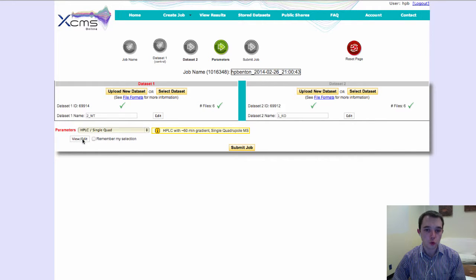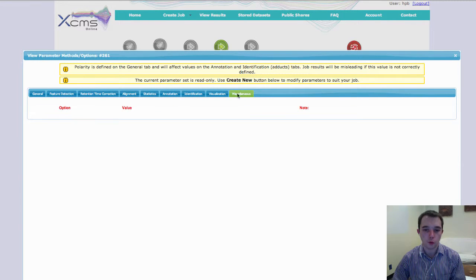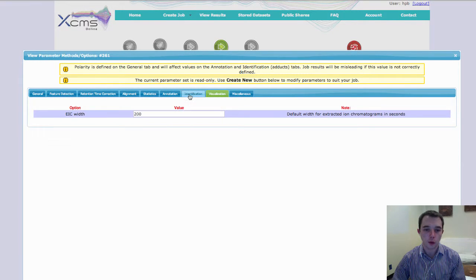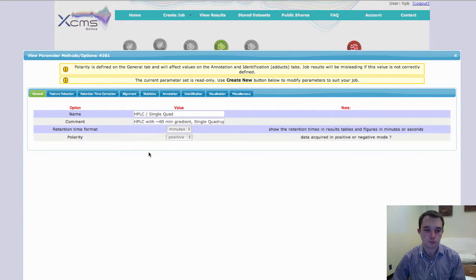Now if you want to view or edit these, we have this little button that you can click here, and this will allow you to go through all the different tabs and see what all the different settings are.